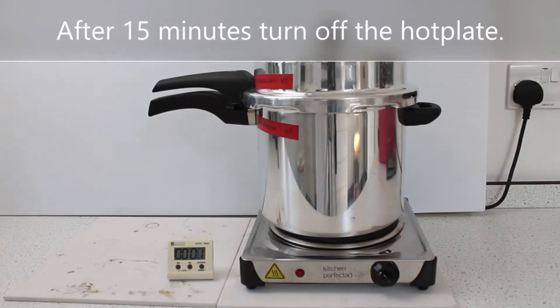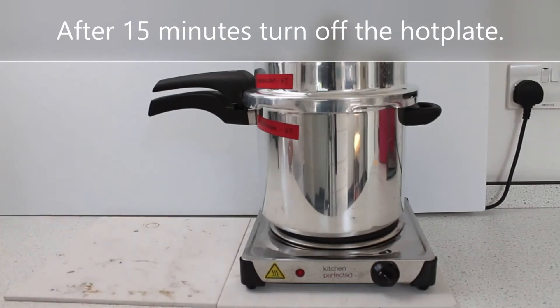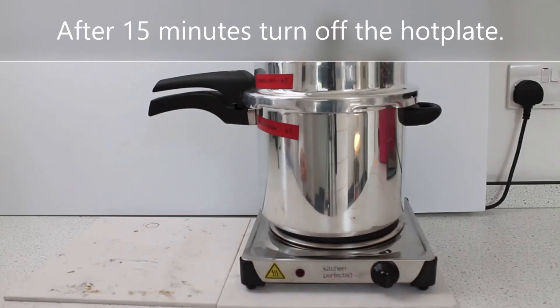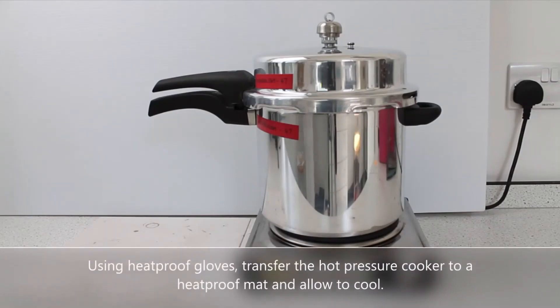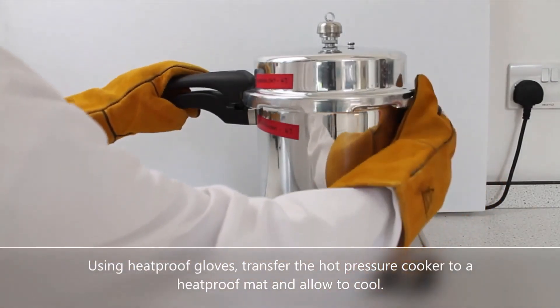After 15 minutes turn off the hot plate. Using heat proof gloves, transfer the hot pressure cooker to a heat proof mat and allow to cool.